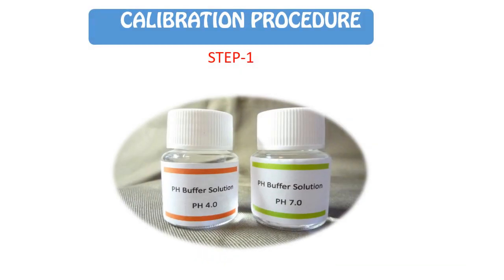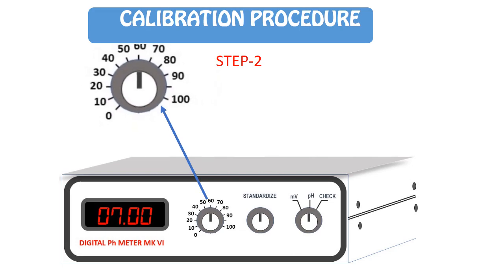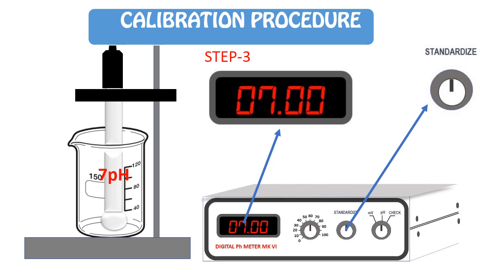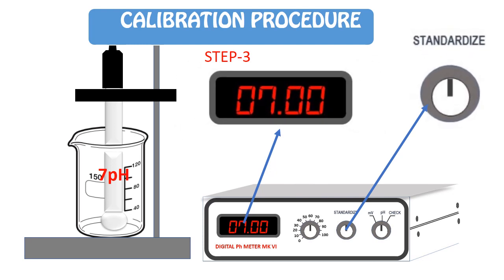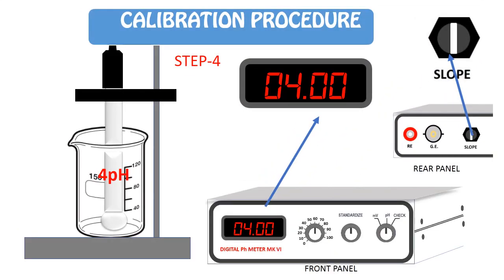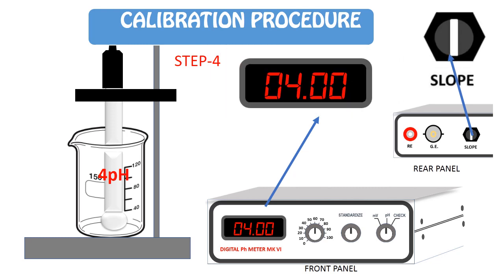For calibration of the pH meter, we need two buffer solutions: 1. pH 7 buffer solution, and 2. pH 4 buffer solution. Set the required temperature using the temperature knob. Put the pH electrode into the pH 7 buffer solution and set the pH value to 7.00 using the standardize knob. Then put the pH electrode into the pH 4 buffer solution and set the value to 4.00 using the slope knob located on the rear panel.